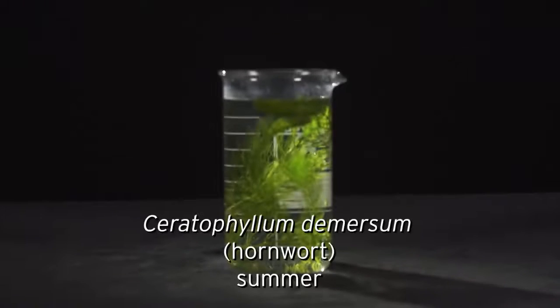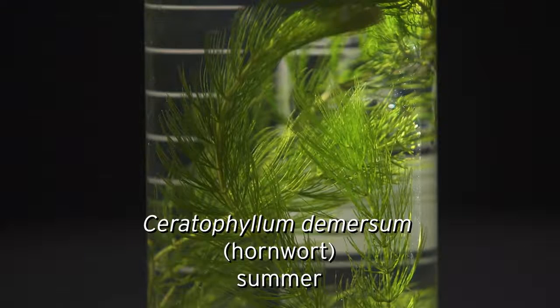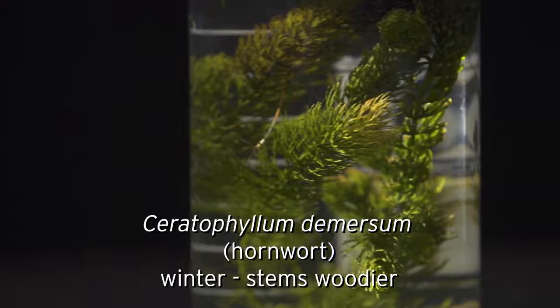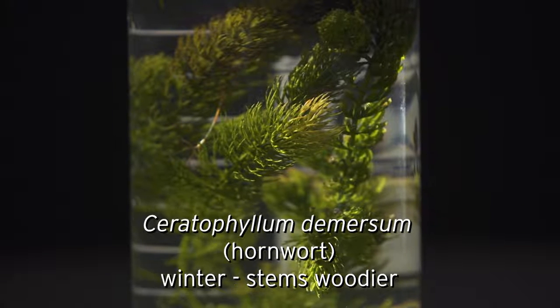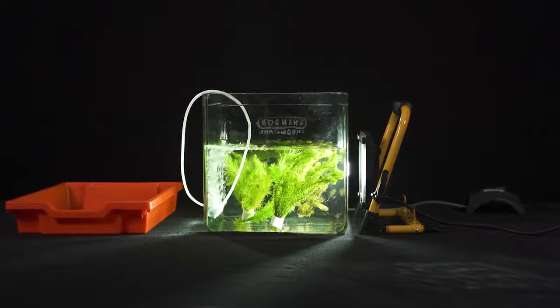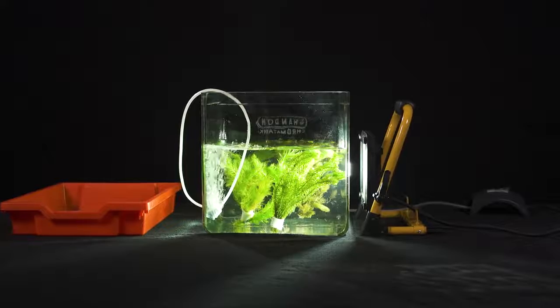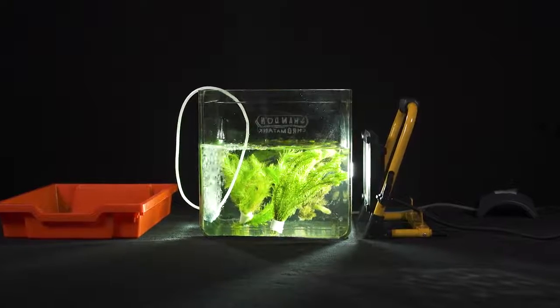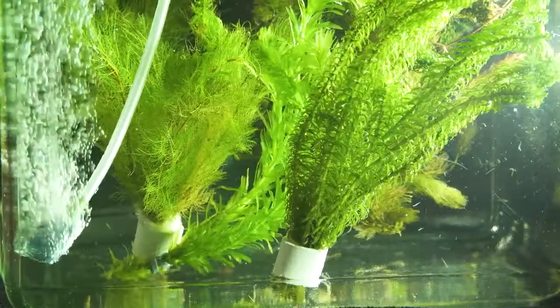The hornwort is hardier as it's a UK native, but it can be very woody in the winter months, which means it can bubble less readily. If you're using pondweed collected from an outdoor pond, do consider that during the darker and colder months, it will not be photosynthesizing at a particularly fast rate. It's a good idea to get this weed out of the pond at least a couple of weeks before the practical is planned to take place, and illuminate it with a bright light in an aerated tank to allow the photosynthetic machinery to become active again.